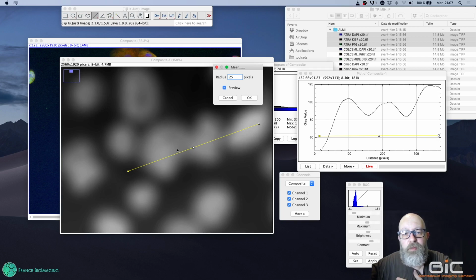of course, I will lose the outlines. And you see that the outlines are spread around, meaning that I won't have a sharp edge around the nucleus, which could be an issue when trying to isolate the outlines.